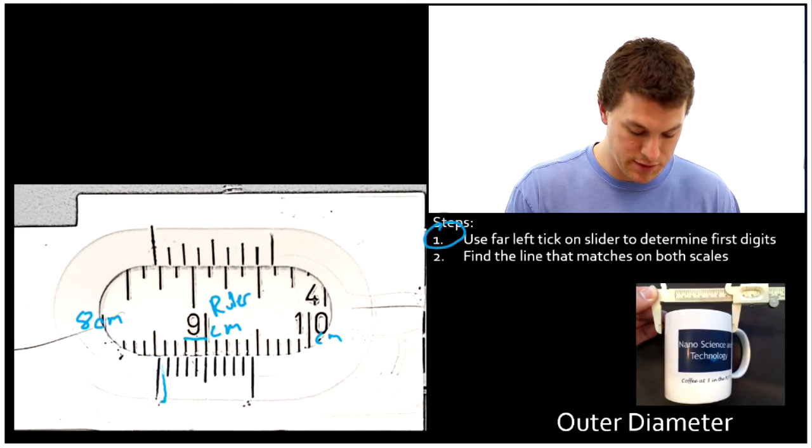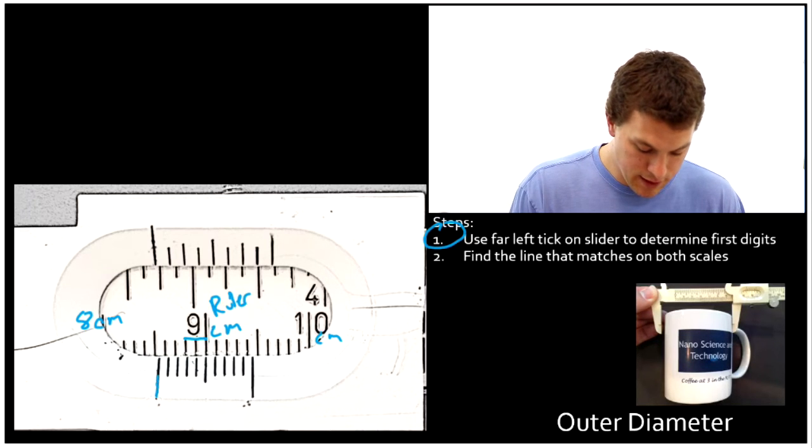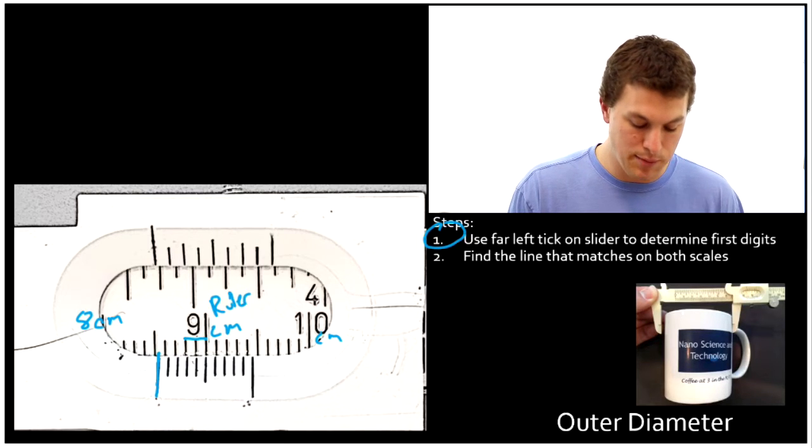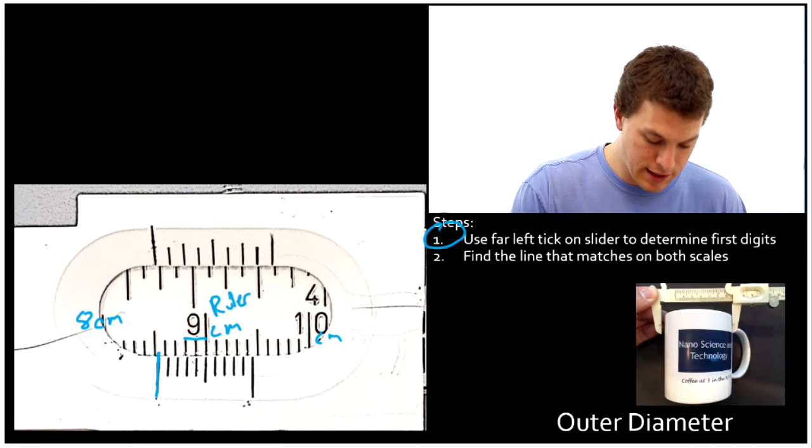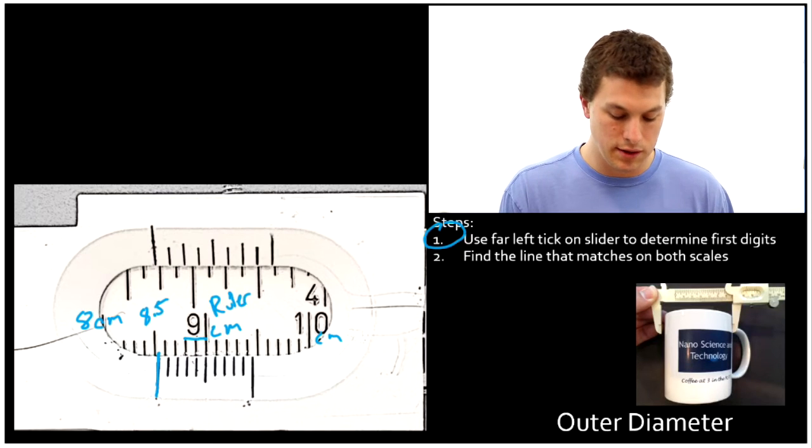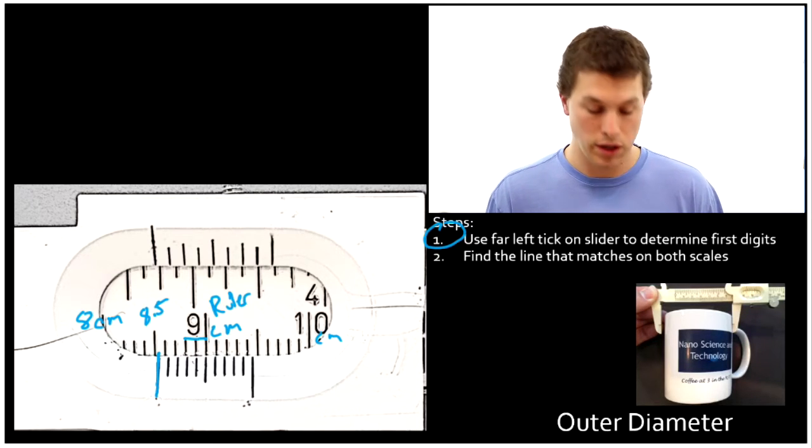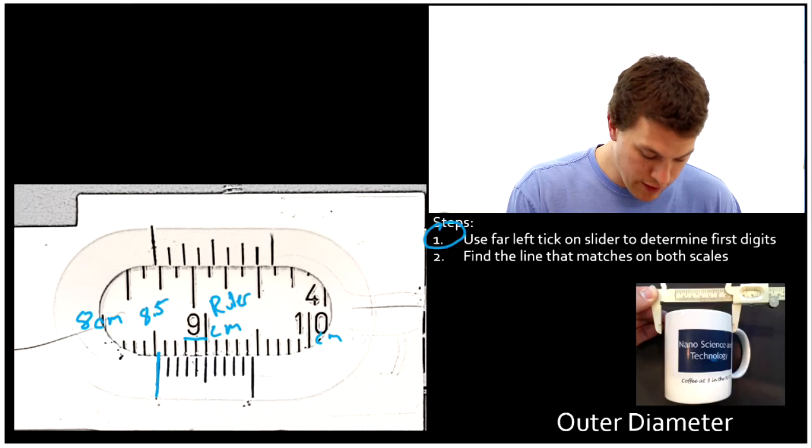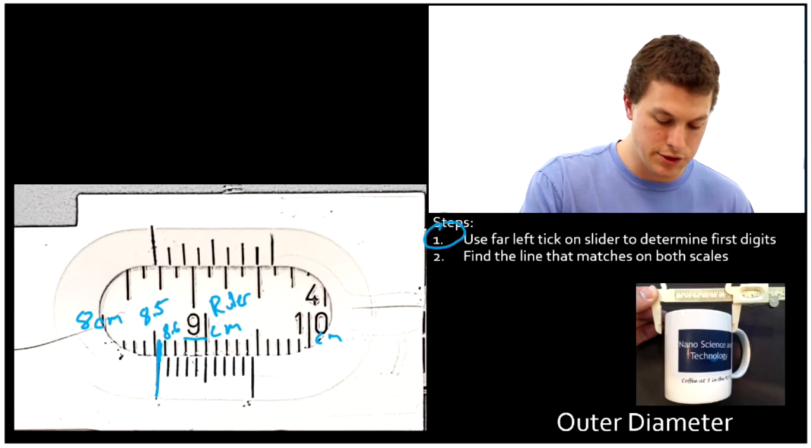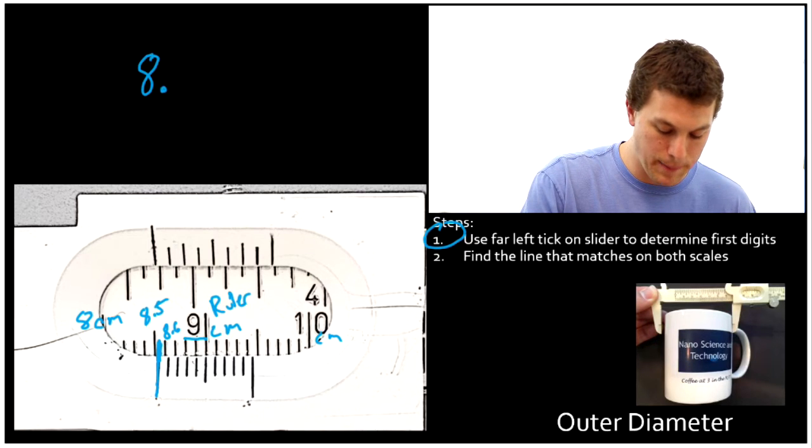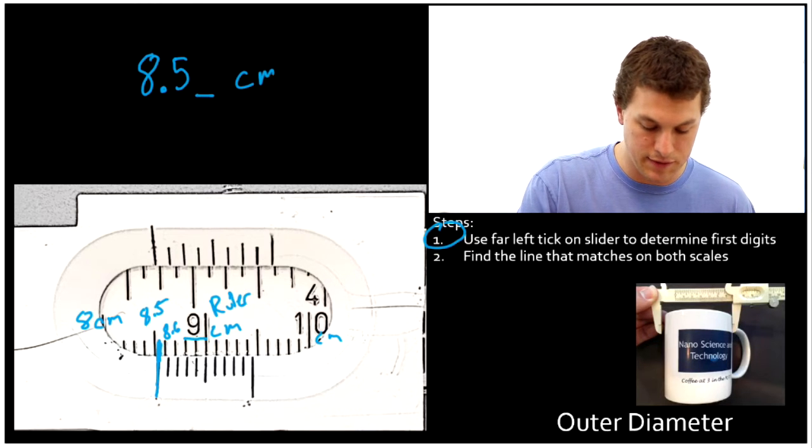This tick lines up right there. Notice this slightly taller tick in between eight and nine is going to be 8.5, and each one of the little ticks here represent 0.1. So this line falls right here between 8.5 and 8.6, and that means the first two things we're going to write down are 8.5. Now we're going to fill in this last digit, and that's going to be in centimeters.